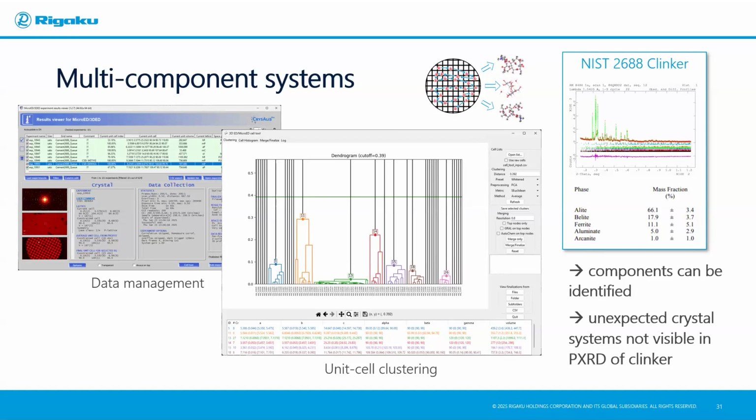Hi, thanks for the talk. Often when I'm doing this manually, I find that my TEM grids are kind of bent. So if I want the full negative 65 to 65 degrees range of the crystal, I have to go from negative 65 to negative 50 and then recenter it, then do negative 50 to negative 20, and so on in chunks.